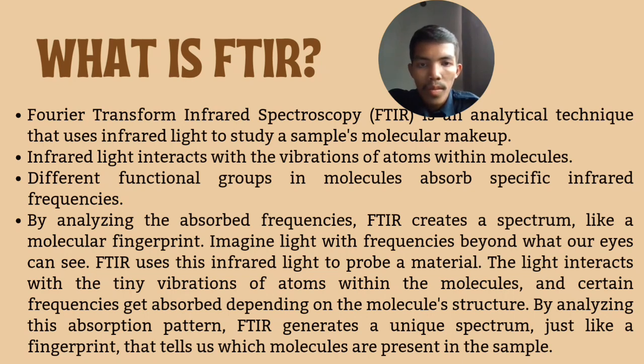Imagine light with frequencies beyond what our eyes can see. FTIR uses this infrared light to probe a material. The light interacts with the tiny vibrations of atoms within the molecules, and certain frequencies get absorbed depending on the molecule's structure. By analyzing this absorption pattern, FTIR generates a unique spectrum, just like a fingerprint, that tells us which molecules are present in the sample.